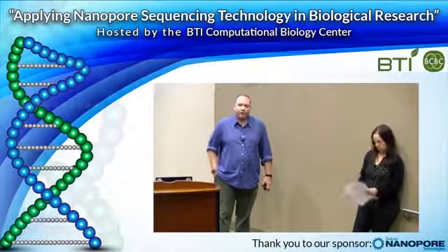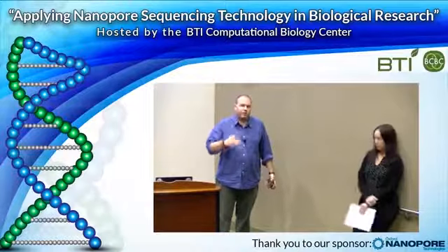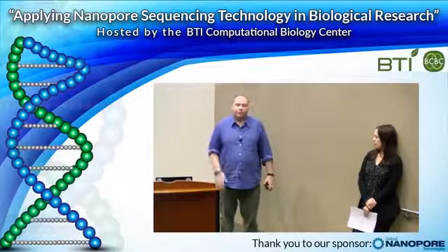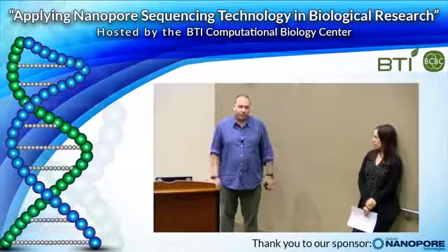But I think even if we did just the Nanopore, because we had only 3 million reads, we would potentially be missing a lot of genes that we might be interested in. So if we want to do just the Nanopore, we want to bump up the number of flow cells. We just did the one, and we multiplexed multiple samples together. So if that was the goal, especially for differential gene expression, you want to do a lot more flow cells for that.